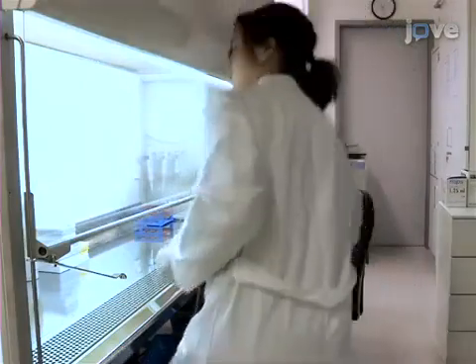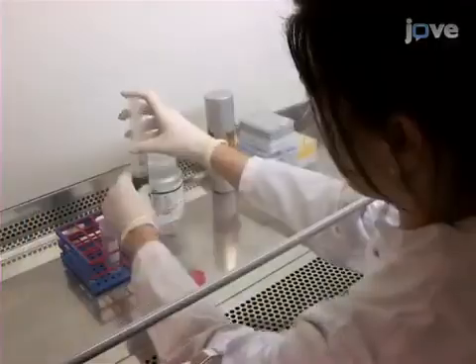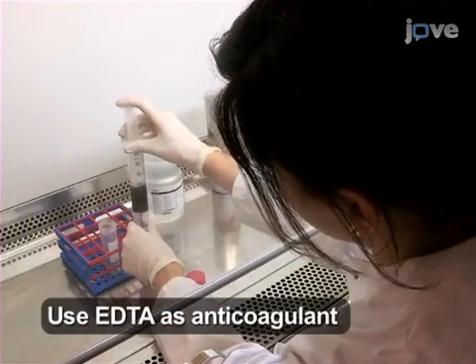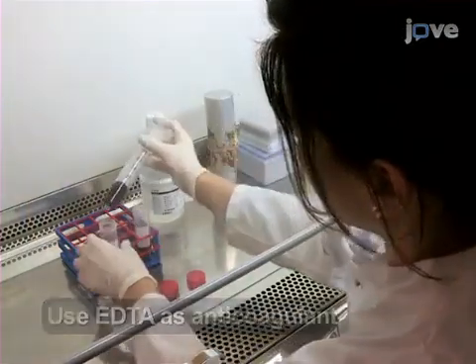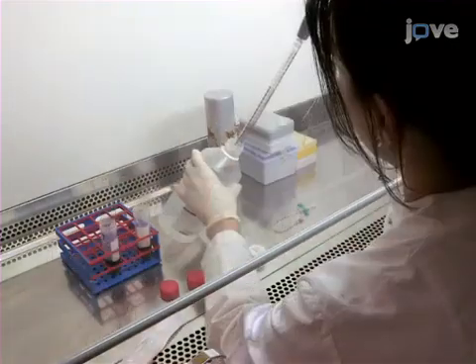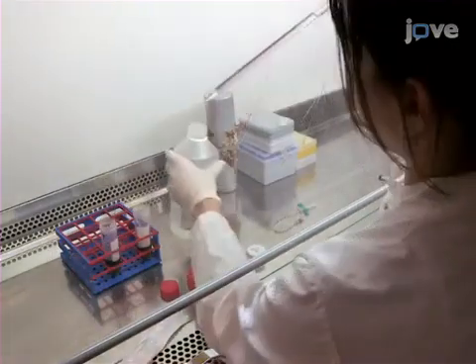After drawing 30 milliliters of whole blood from the forearm vein from a volunteer, split the blood evenly into two non-polystyrene 50 milliliter conical tubes, then dilute the blood in each tube with 10 milliliters of PBS.